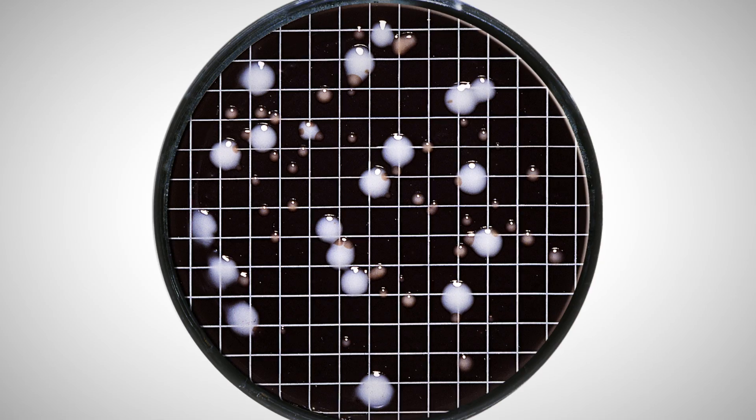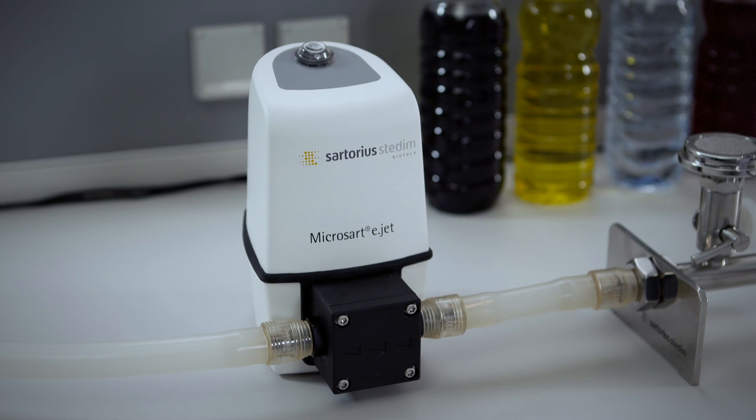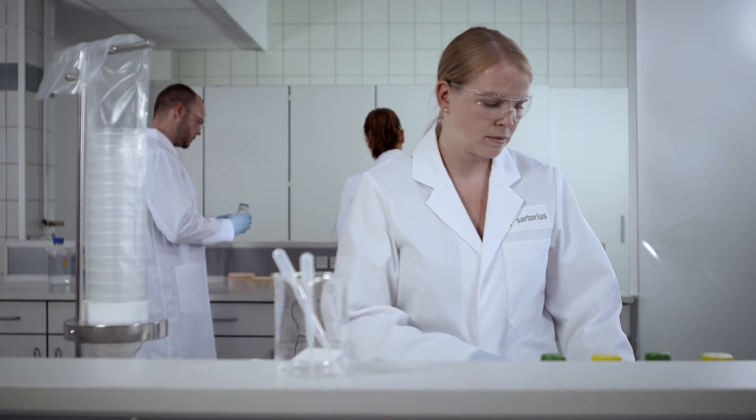Reduce work time and simplify your microbiological testing procedures with a selection of hardware and consumables tailored to meet your specific microbiological testing requirements.